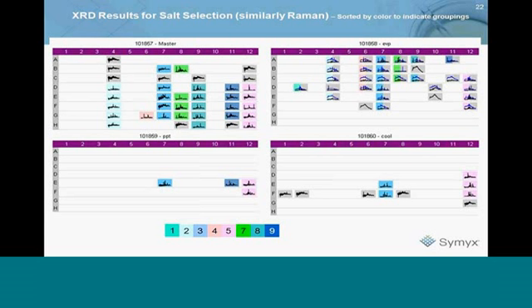This may not seem as significant when you're only doing 1 or 2 or 10 different analyses, but if you're doing several hundred analyses at a time, the only way to really compare results is to print things out and do a very laborious comparison of whether or not you're seeing peaks shift or new peaks appear. The software package we have allows one to handle very large numbers of samples quite conveniently, and allows scientists to look and review large sets of data and pick out which ones are the same and different, and be able to do form assignments based on those.